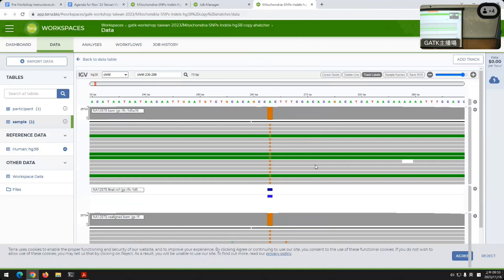But because of that large depth, you have to be careful in how you process it, okay? Again, with that many reads, you're going to have issues with just the natural, relatively low 1 in 1,000 baseline error rate of the sequencing. It piles up, so a naive caller might not be able to handle it. They can just downright explode. But that's why we gave you the special version of Mutect in here.